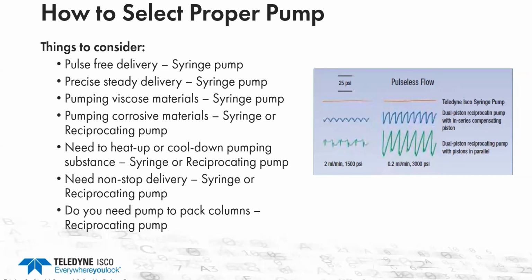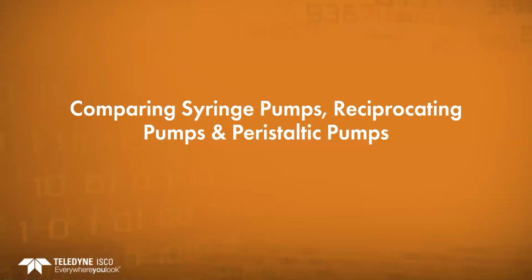Going through other requirements or options, we can see there are other pump types which can be used. But if you are not fully sure how and where this pump will be used, a syringe pump would always be the best default pump for most of your future needs and applications. So let's compare these pumps.